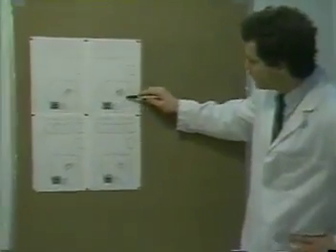In previous experiments, Tom analyzed PBL from three sets of identical twins. In each case, the staining patterns from one twin turned out to be barely distinguishable from the staining patterns of the other twin. In the study Tom is running today, he will analyze PBL samples taken from a set of identical triplets, Brooke, Christopher, and Byron Van Dyke. As Tom runs this experiment with FACS Desk, we will periodically return to our animated microworld to see what the Magic Secretary is up to.